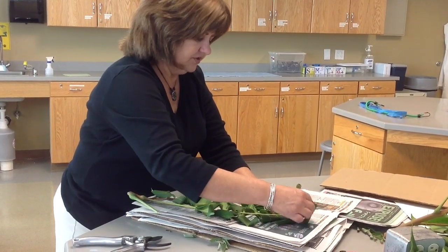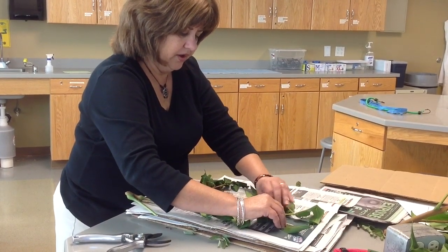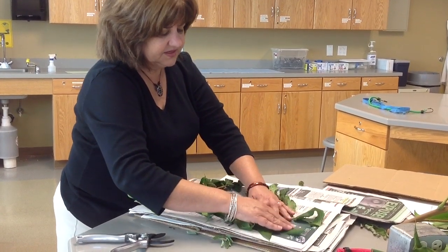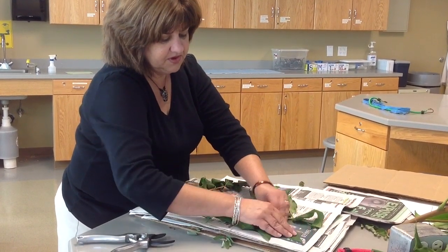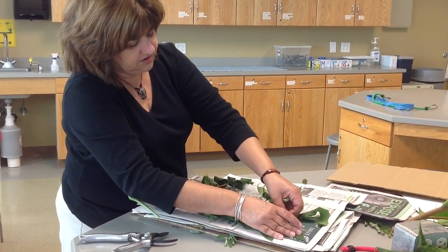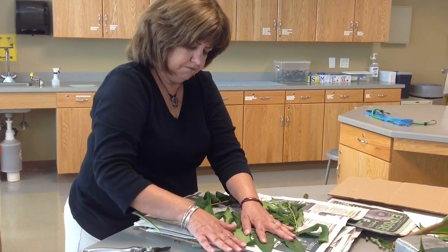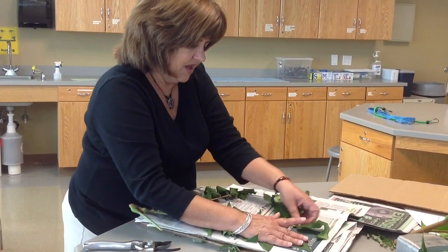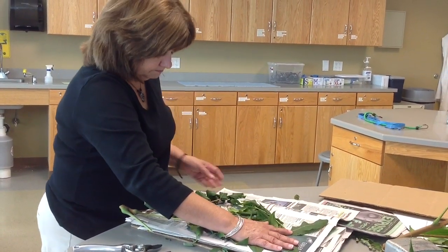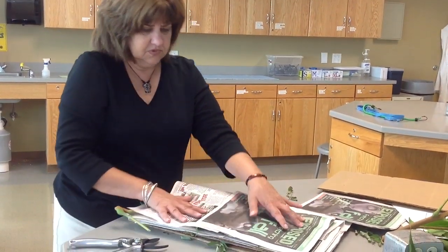I'll try to get the leaflets flattened out onto the paper. Once they wilt it becomes much easier, but I don't want the leaflets all curled up — because then I won't be able to see the shape of the individual leaflets or their edges, so I can tell whether they have teeth or whether they're smooth. I may have to come back and do these the next day, but the idea is to try to get them spread out for pressing.